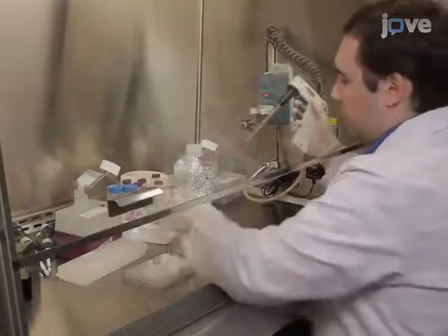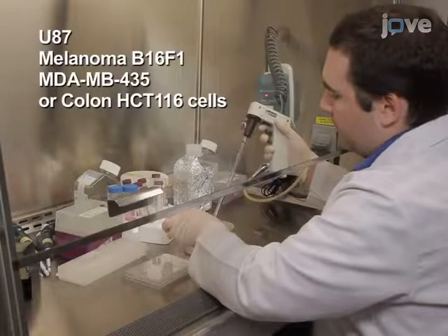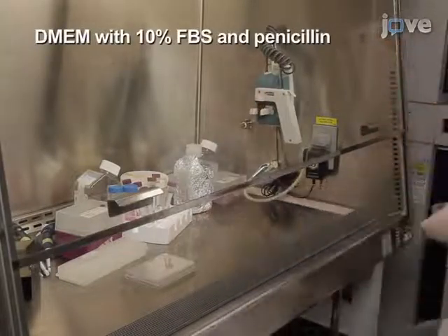To prepare tumor cells, begin by culturing U87, melanoma B16F1, MDA-MB435, or colon HCT116 cells in DMEM supplemented with 10% FBS and penicillin.